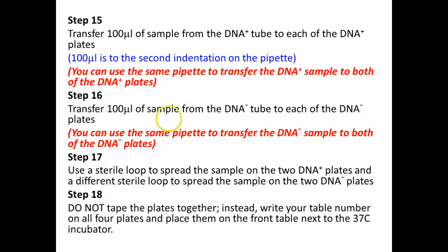Okay. So do not tape the plates together like they tell you in the lab manual. Instead, write your table number on all 4 of your plates. Place them on the front table, right, next to the 37 incubator, and we'll put them in the incubator.